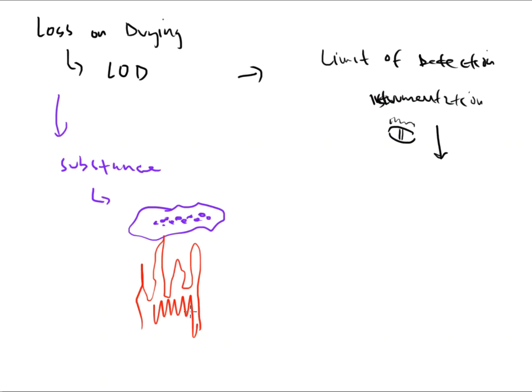So we heat this substance up, and what happens is that the moisture, of course, is evaporated off. Whee! There it goes, up into the air and away. And we see a loss of moisture. Well, moisture has mass. Mass is the amount of stuff that something is made up of. All right, well, if we lose mass, then we will lose weight on a balance. So this is a simple calculation here.